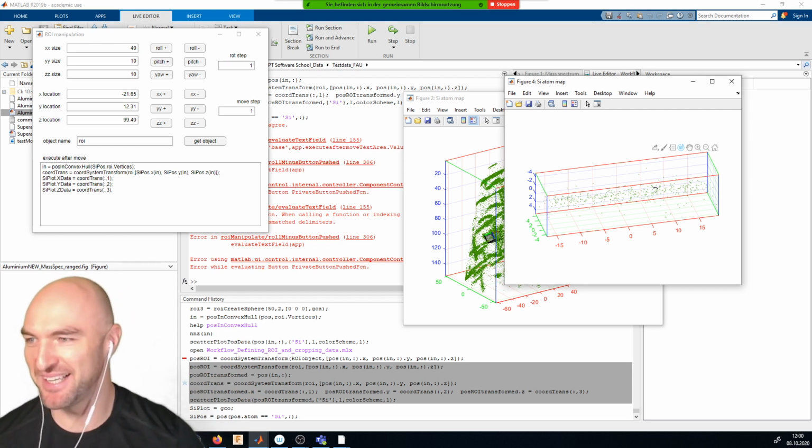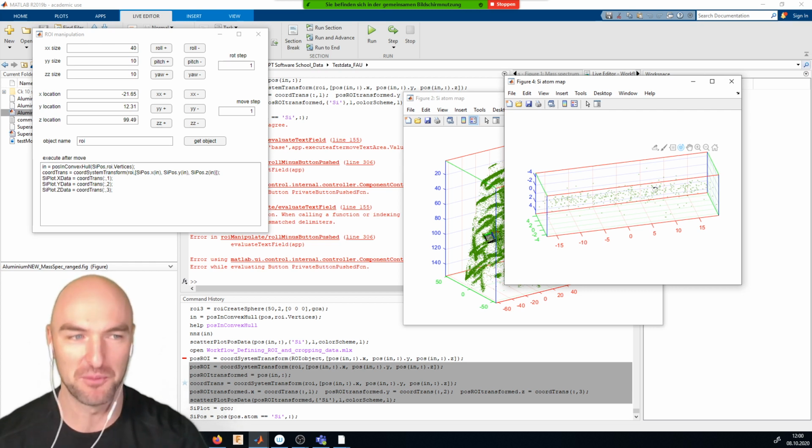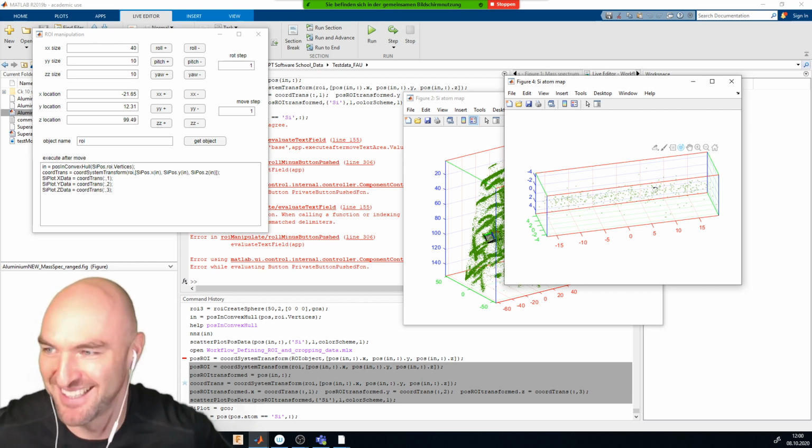Oh, thank you, Dita. Obviously the folks at Northwestern University are the pros when it comes to proximity histogram. They've created them after all. Obviously this would not be a proximity histogram, it would be a radial profile. Thank you for that, Dita.